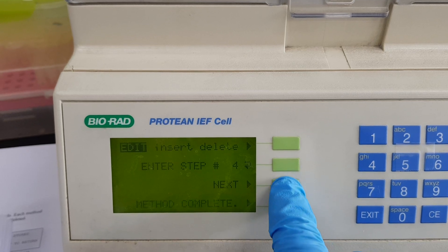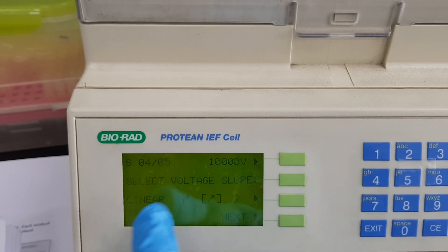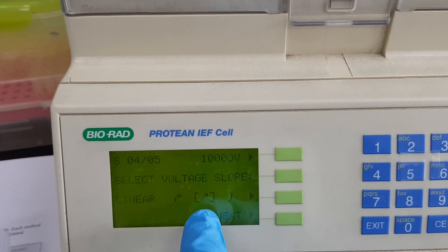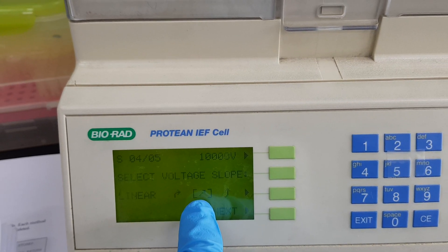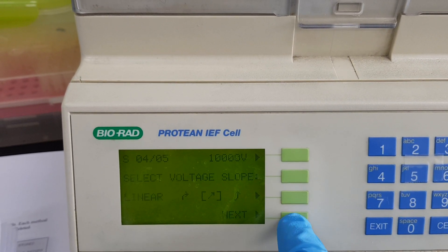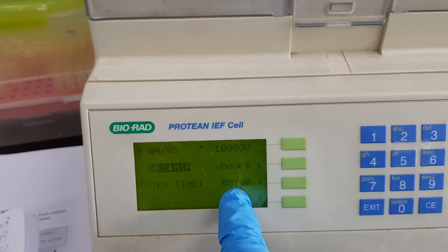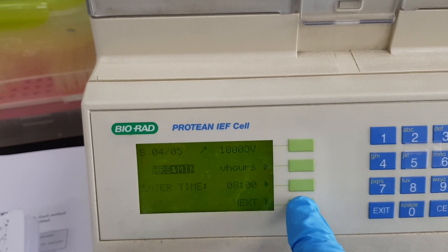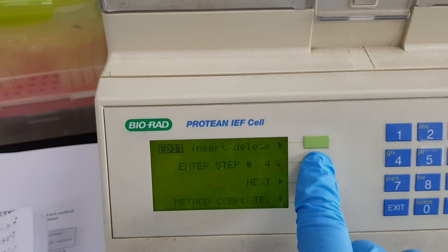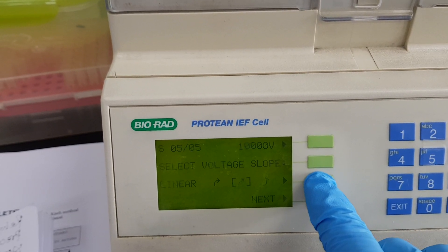Now I go to step four. Step four is 10,000 volt. I select the linear voltage for step four, and then move to the next screen. The time for 10,000 volt is eight hours, so I enter eight hours and press next.